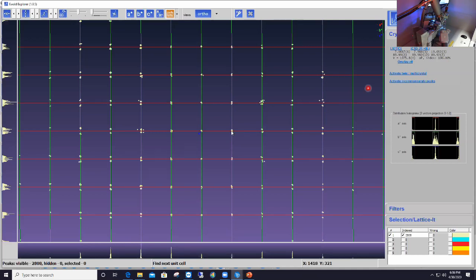Whereas I know that as a crystallographer, that one row of reflections should be indexed in one lattice, and the second row of reflections should be indexed in the second lattice. But again, if I had only trusted the numbers, I would have never found out that there was a problem with that crystal. Okay? So again, if you see something like that, discard the crystal and screen some more and see if you can at least find a better one.